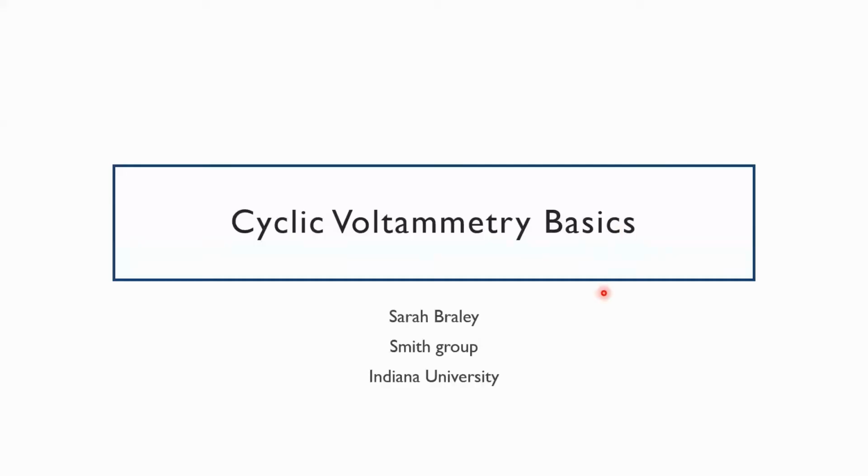Now, my name is Sarah, and I work in the Smith Group at Indiana University, and today I'm going to be talking about some basics of setting up cyclic voltammetry experiments.